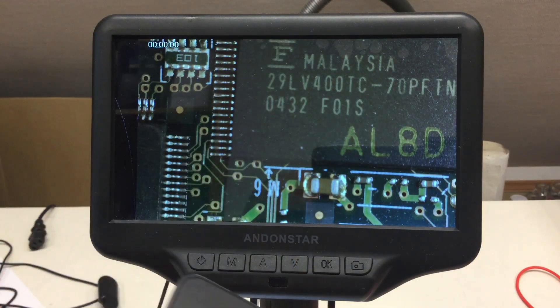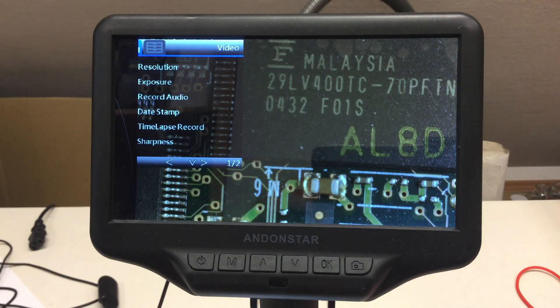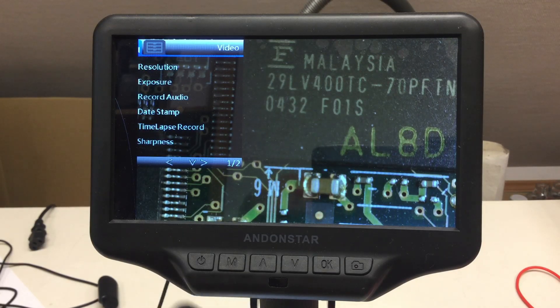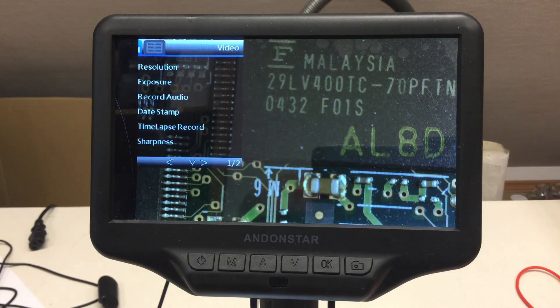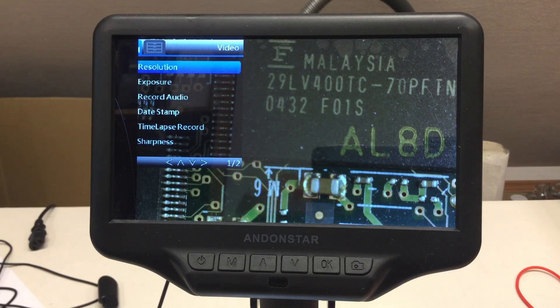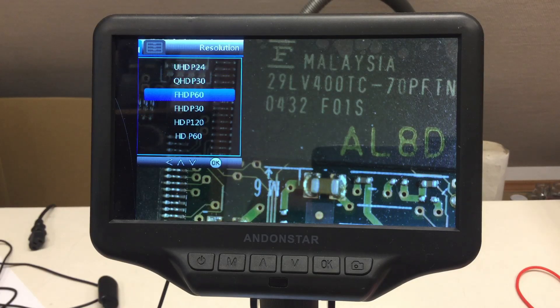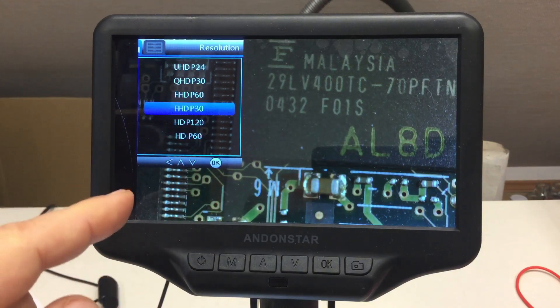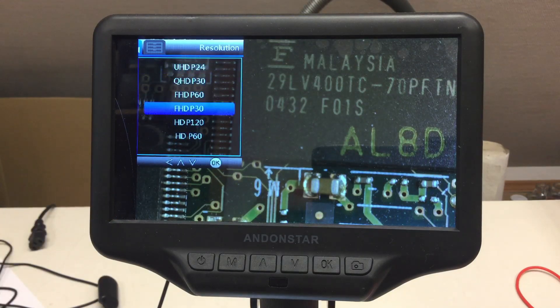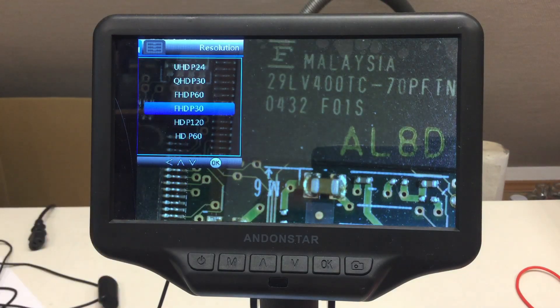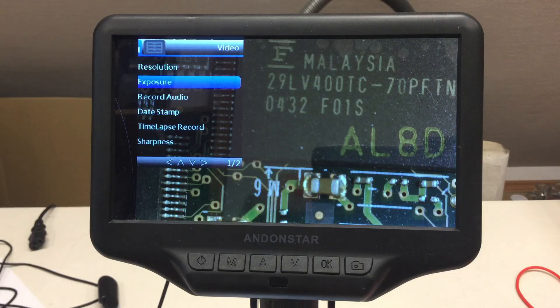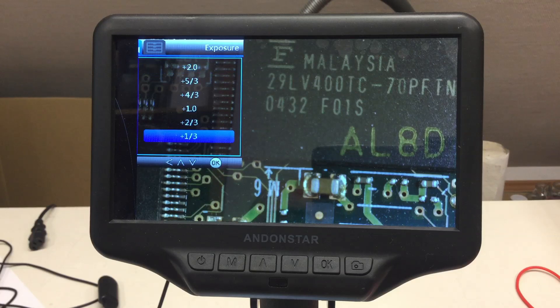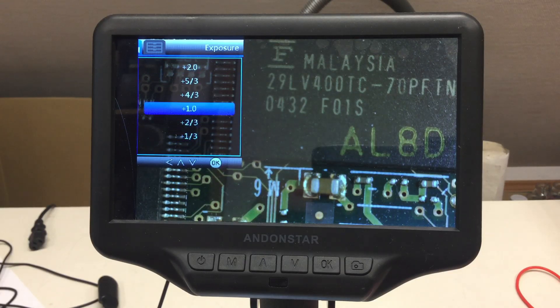I have the remote here and I'm pointing it. Go into the menu and, for example, hey, go into the menu. Same problem as always. I think we can set the resolution to full HD 30p. That didn't work the first time, but let's try it again. Let's check, did I set it to full HD 30p. And let's crank up the exposure to let's say plus one.